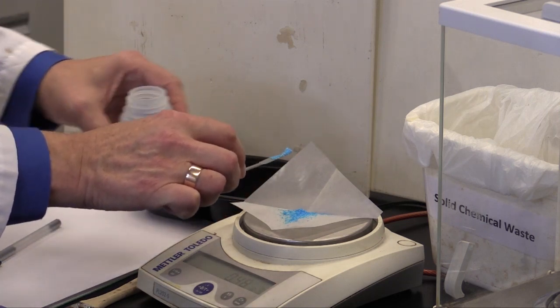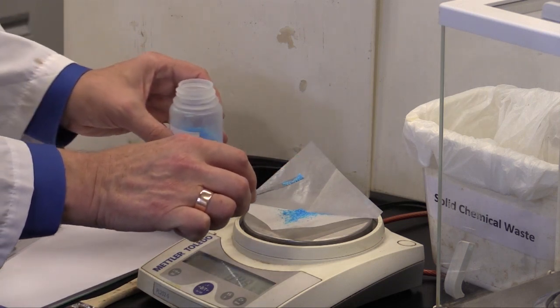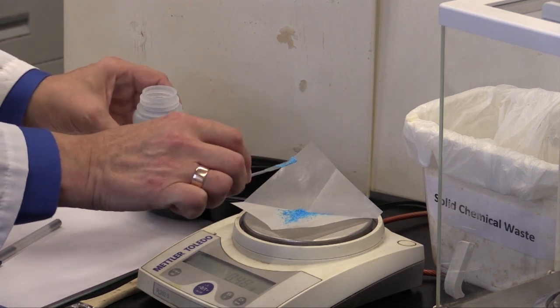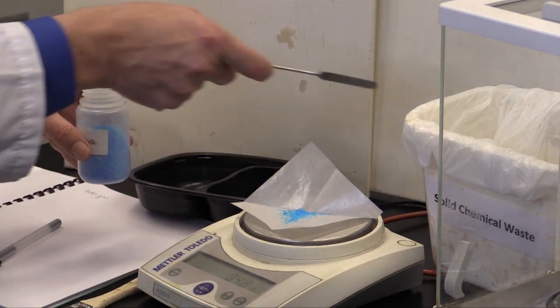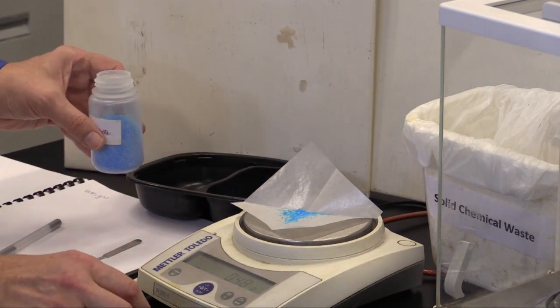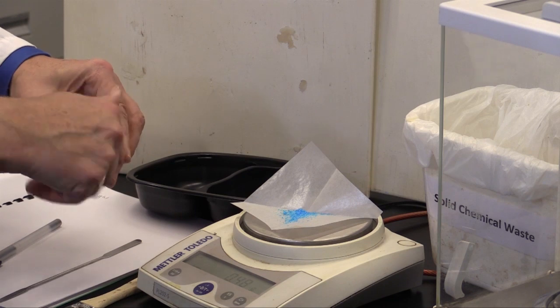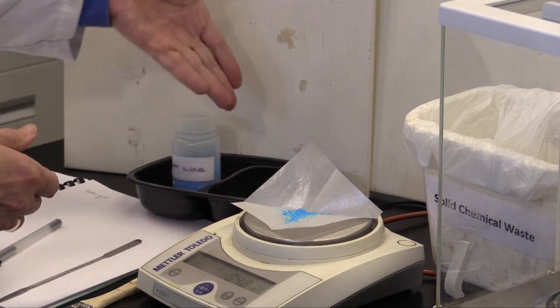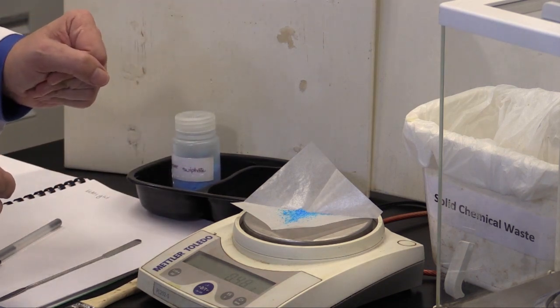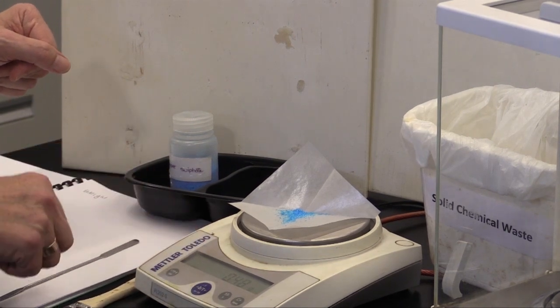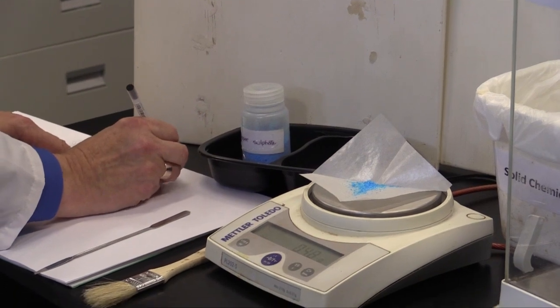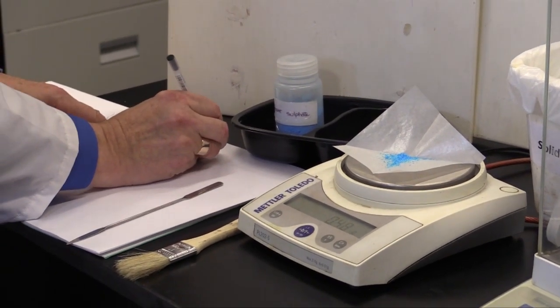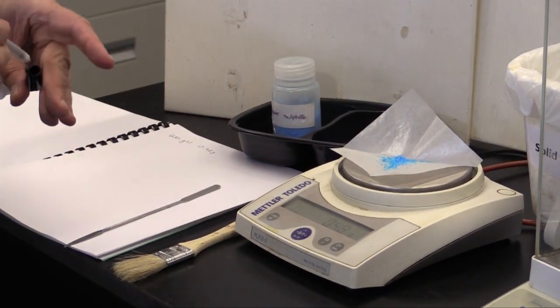Now this that I have taken out of the flask never goes back in. When you have taken something out, if you're not using it, it goes into the solid chemical waste, which will always be right next to the balances. Then we cap the chemical and put it back in the tray that it sits in. At this point, I've got 0.48 grams and I take a note of that weight here in my notebook, 0.48 grams.